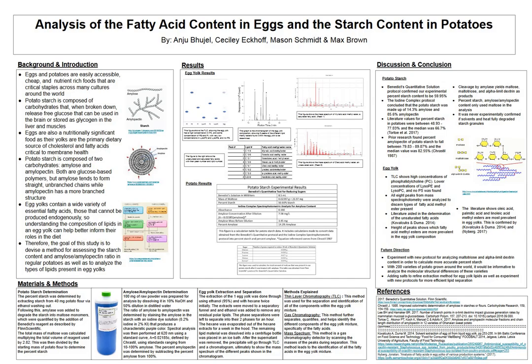The absorbance of the iodine amylose complex was 0.166, which, working with the standard curve, gave us a concentration after dilution of 7.58 milligrams per liter. Before dilution, the mass was 3.45 milligrams. This gave us a percent amylose of 14.3, which falls comfortably into the range that was outlined in the literature. And again, we discussed some of the reasoning for why we got this result further on in the discussion.